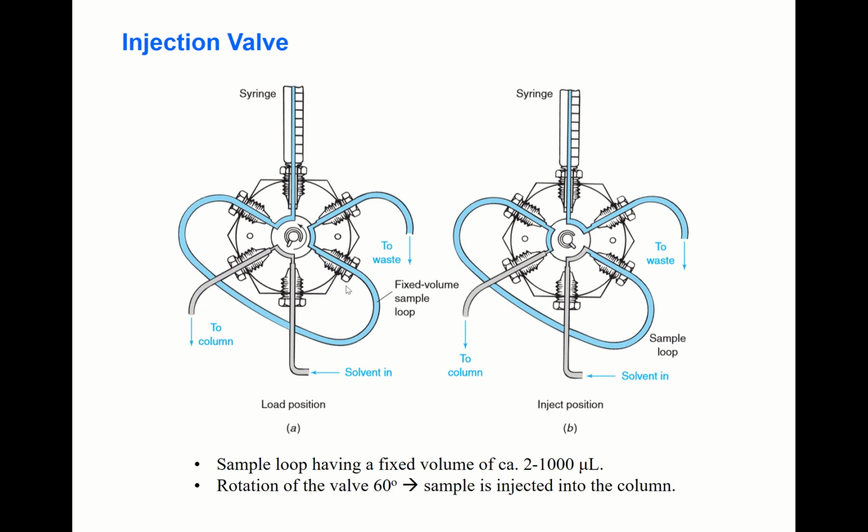So this is the loading position, before injecting your sample to the column. Only solvent is what enters the column.